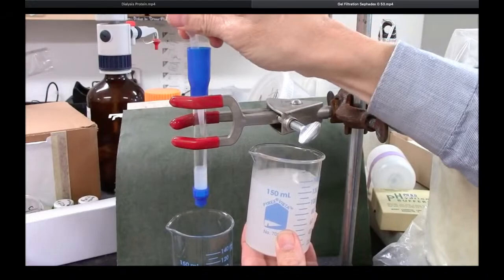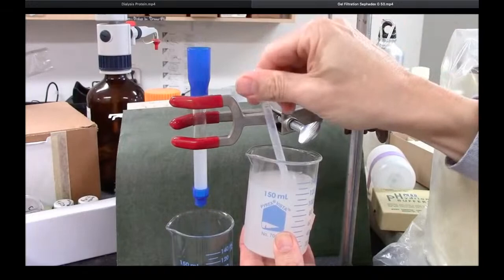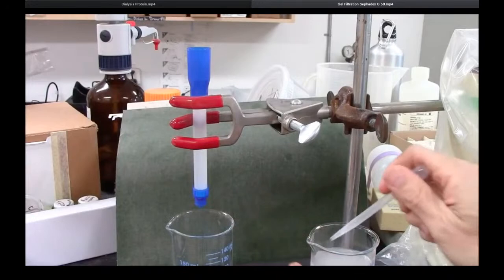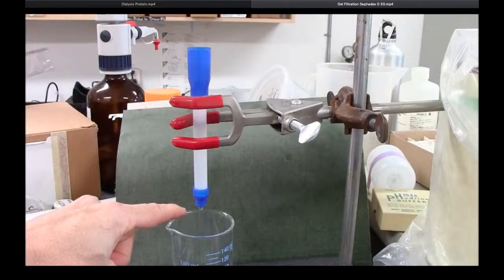For gel filtration, I want a fairly tall gel bed. So I'm trying to mostly fill this column. And excess buffer will drip out the bottom. So here you can see the drips coming out the bottom. Gel bed is starting to settle a little bit.